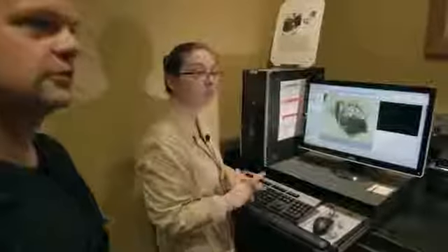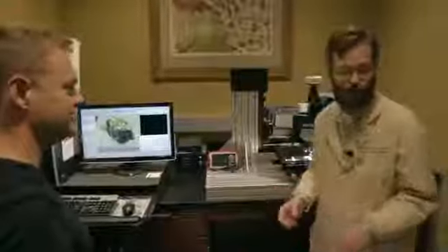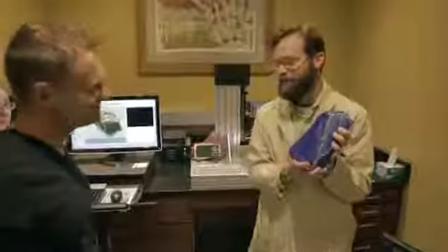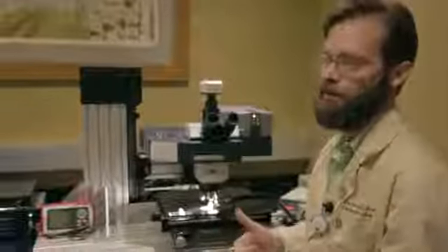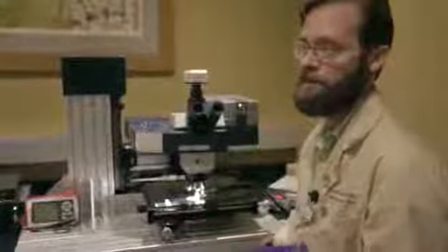Now you'll remember that the blue pigment in the false color infrared was suggestive of ultramarine. Yeah. So for ultramarine, from a 1300s painting, we would expect the source to be lapis lazuli. We're essentially going to bounce a laser beam off of the surface of the pigment particles and measure its scattering. And that's going to become a molecular fingerprint for a particular compound, or in this case, a pigment.